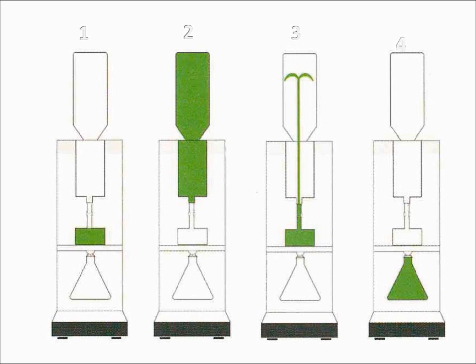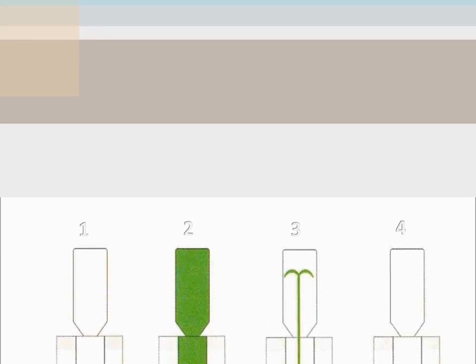Once the method is confirmed the four steps can be performed with the touch of a button. Now let's see the instrument in action. Hi there my name is Vincent and I'm going to be talking about the SpeedX 1000 designed by Horizon Technology. This system is specifically designed for extracting oil and grease under EPA 1664.